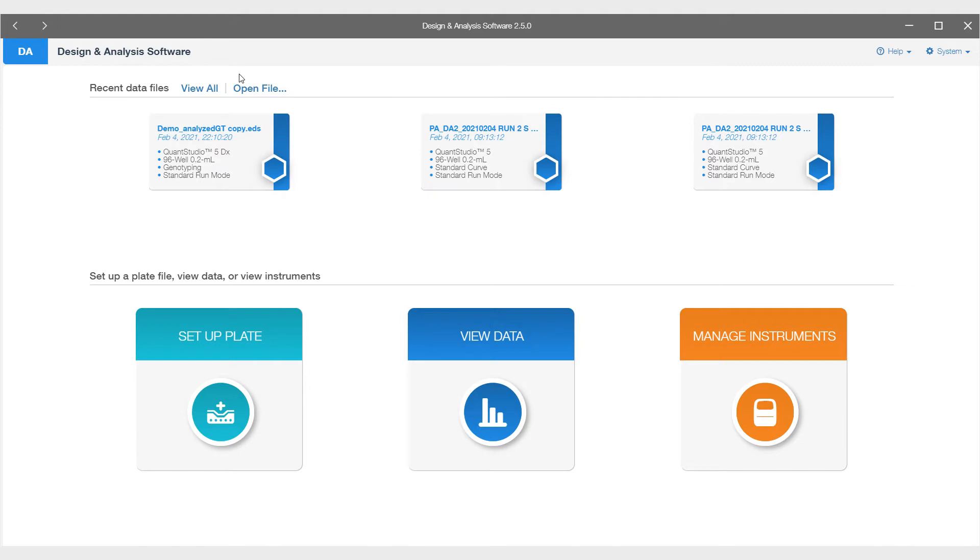The analysis of the TaqMan SARS-CoV-2 mutation panel is done in Applied Biosystems Design and Analysis Software 2.5 or later with the Genotyping Analysis module. This analysis software is used no matter what real-time PCR instrument you used.